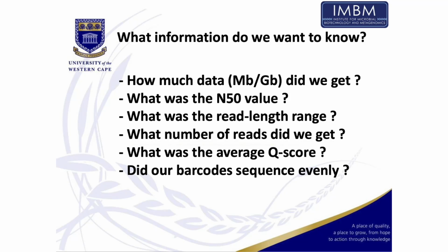So for very complicated genomes, it's really beneficial to have these super long reads. And nowadays with Oxford Nanopore, if you know what a telomere is, those are the sequences at the end of a human chromosome, they're talking about telomere to telomere assemblies of human genomes. They can finally do that with long read technology.